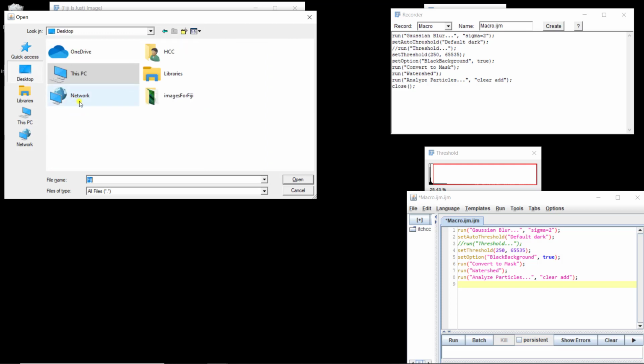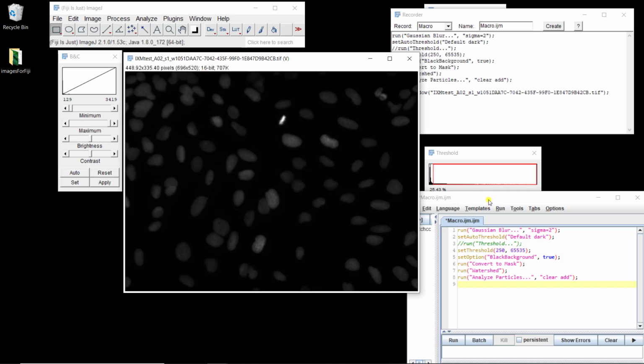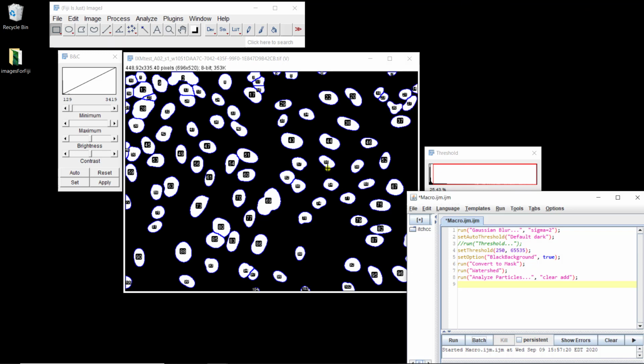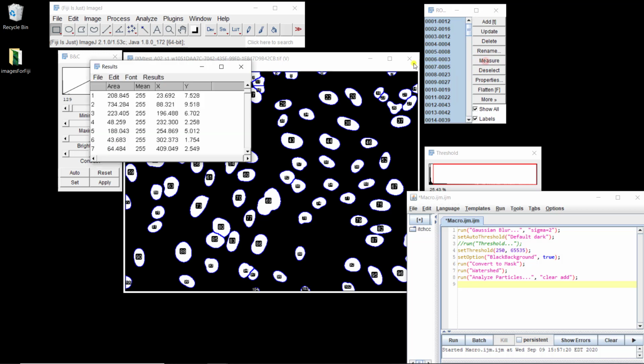All right. And now if I go to the macro that is actually exactly what we recorded and run it, you see you get in just one click all the different steps you did before, and you can go there. So let me redo that. You can just go there and measure, and you get your files.